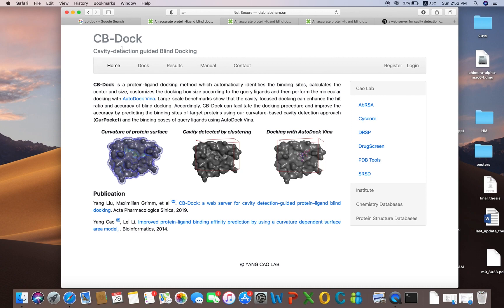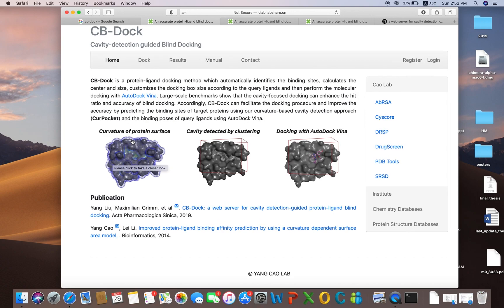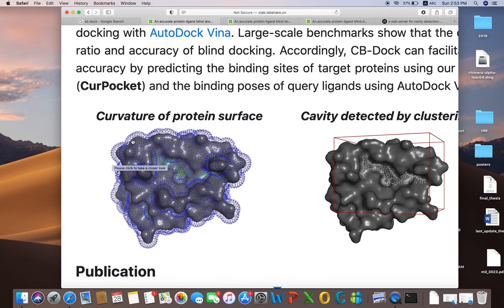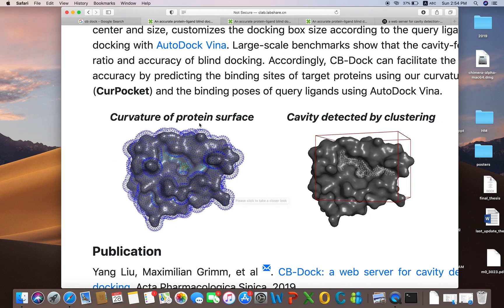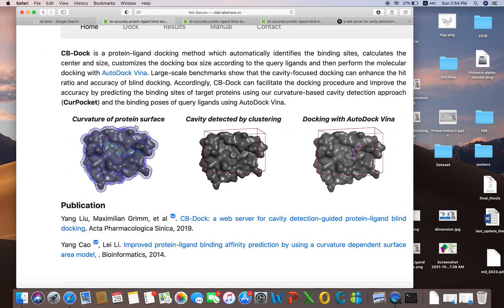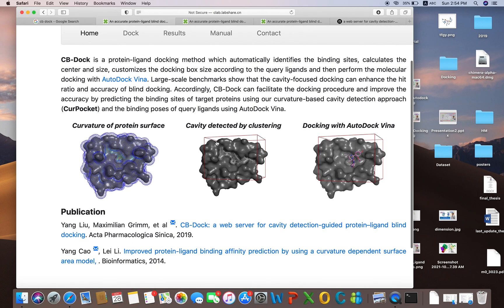On the main page of CBDock, this is basically cavity-detection-guided blind docking. Blind docking is docking in which we use the full protein. The server will find out the curvatures of the protein in the full structure you have given, and after detecting the cavities or curvature, it will try to dock your ligand in that specific cavity.